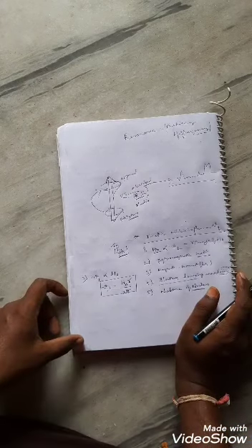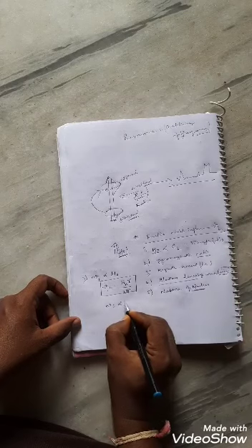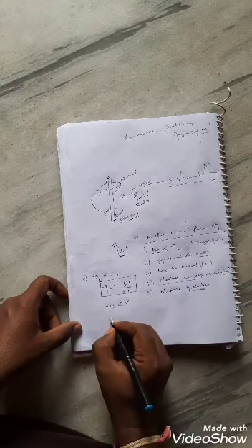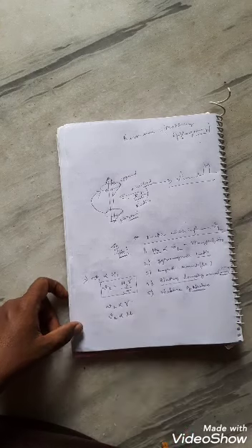And so the Larmor frequency is directly proportional to gamma, and, as I said, it is also directly proportional to the magnetic moment of the nucleus. All right.